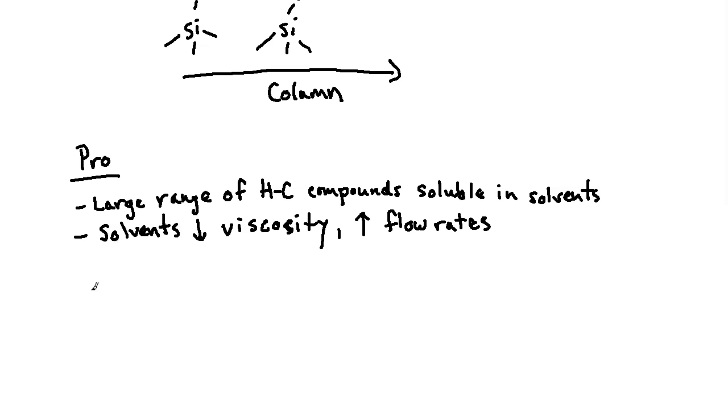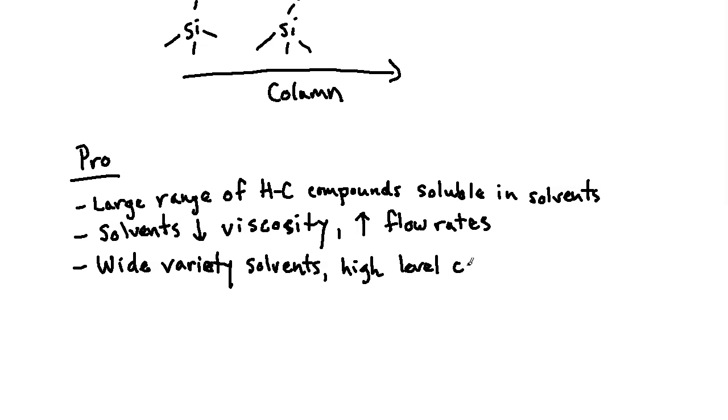Okay, now another thing to consider is that, generally speaking, there's going to be a wide variety of nonpolar solvents. There's still a decent variety of polar ones, but there are a lot of different ones that would be considered nonpolar up to mild polarity. And so when you have a wide variety of solvents at your disposal for mixing and matching in these situations, you usually can have a high level of control or specificity over retention.